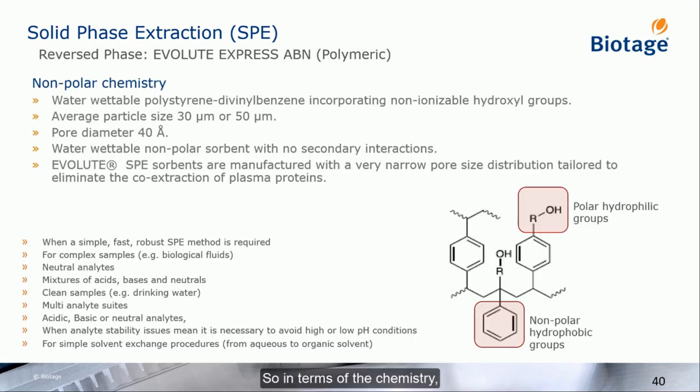So in terms of the chemistry, I'm just going to detail here some of the polymeric options. Over the years, silicas have been widely used. A lot of the more recent phases are polymeric.